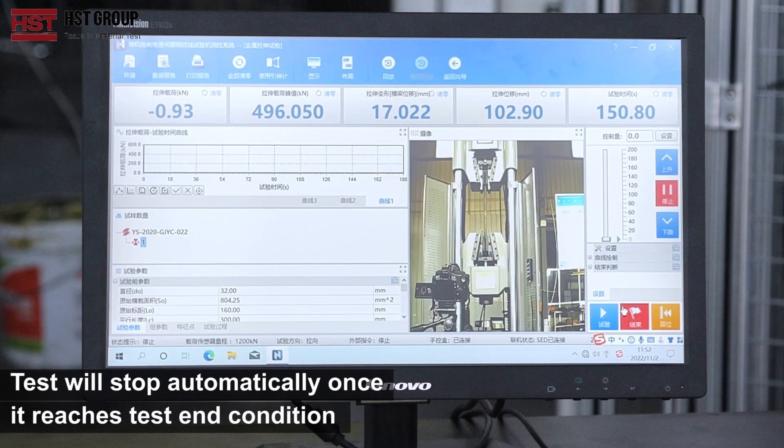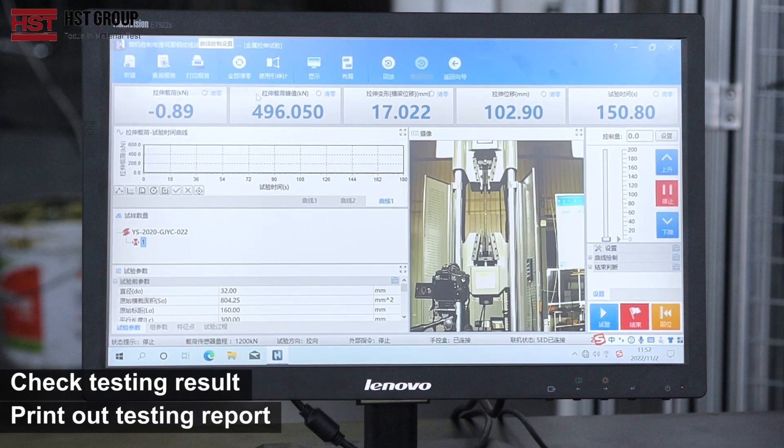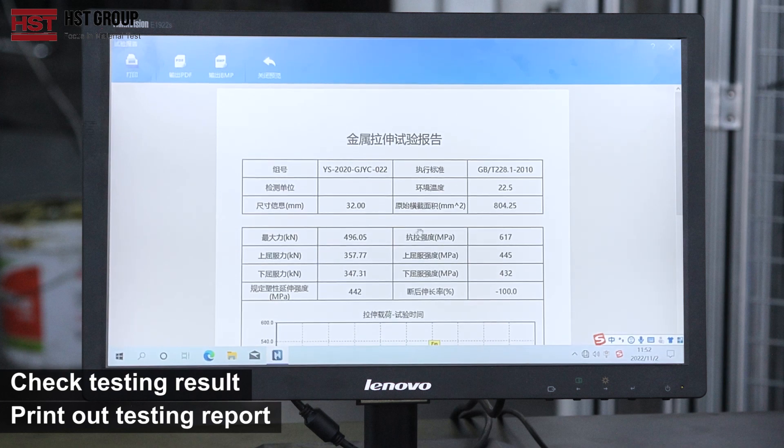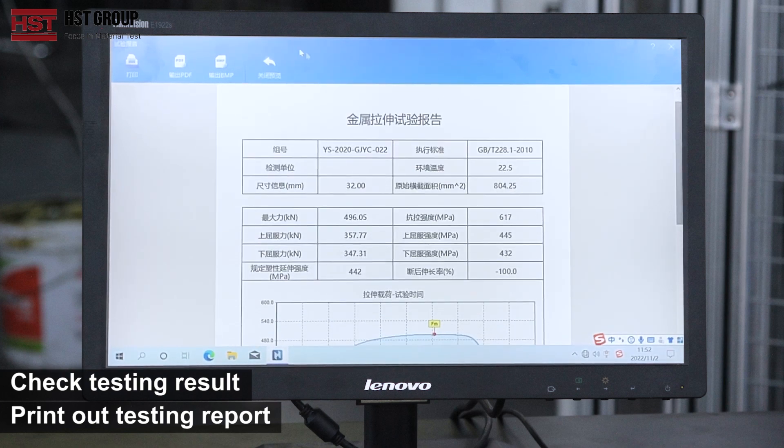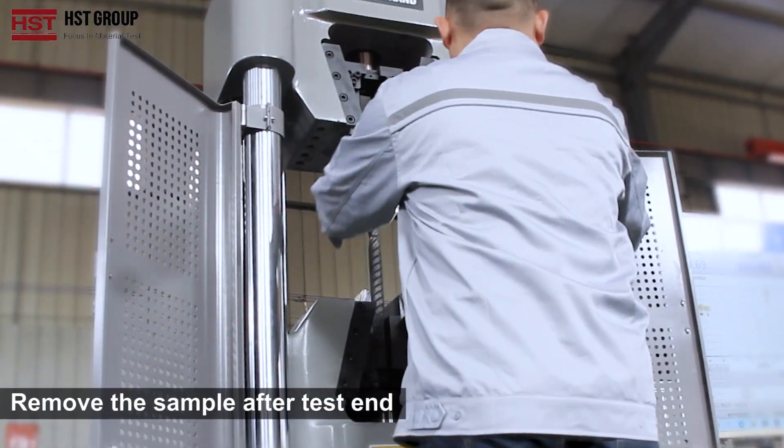The test will stop output once it reaches the test end condition. Check the testing result and print out the testing report. Remove the sample after the test ends.